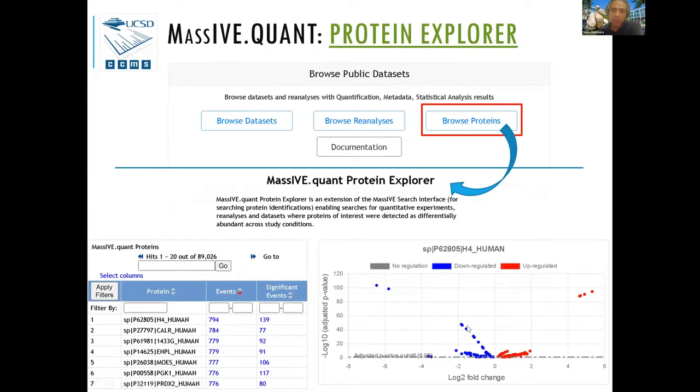So you probably have seen volcano plots in specific experiments, where there are a bunch of different proteins and each dot is a different protein. Here it's the same protein across different data sets. So you can see how significant it is when you see a twofold variation in expression. Is that common or is that rare?